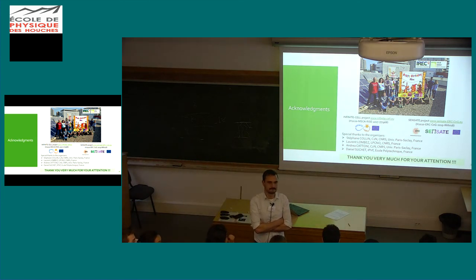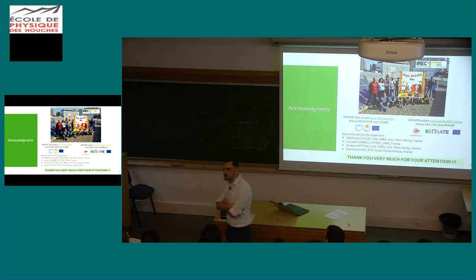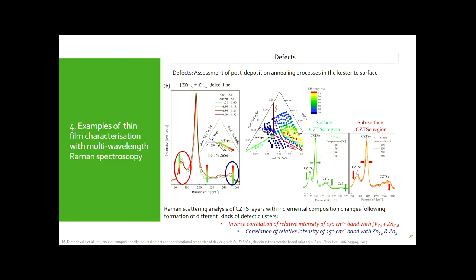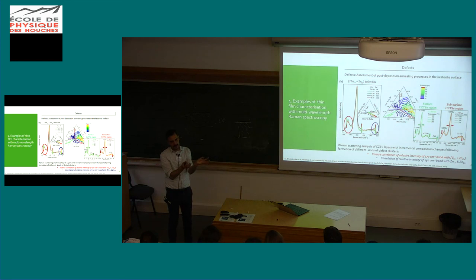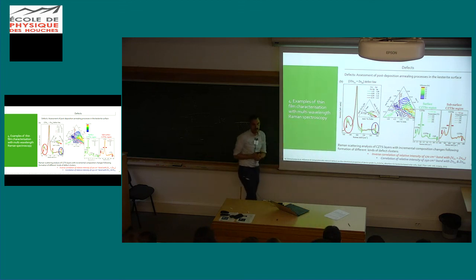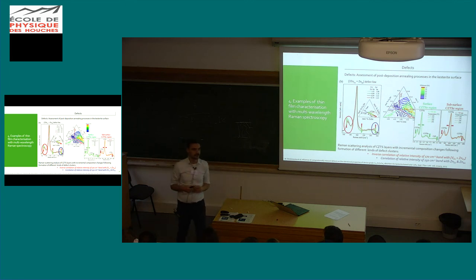In kesterite, there are some people who take a ratio between different peaks to get an idea about order and disorder. Do you believe that is correct or not? Yes, I think so, but it's mainly the A1 peak. When you start to disorder, your material is a kind of evolution between the kesterite phase and the stannite phase, so it's something in between. The stannite phase has a peak at lower frequencies than what you observe when you start to introduce this copper-zinc disorder, because it's in between the evolution to these phases. You observe a shift of this peak and also a broadening of this peak, because you have a more disordered material. So I fully trust this.